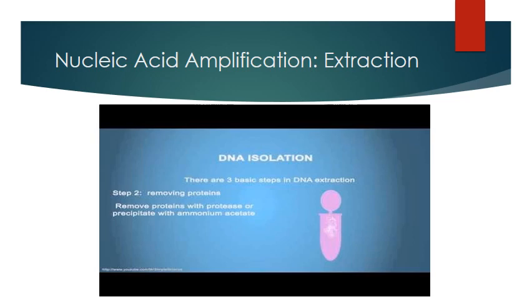So here is another video which you can watch at your leisure. This is a DNA isolation technique, which you can just look through as a tutorial. I'm not going to read it because it'll be read to you. And this is just for the extraction of nucleic acid. This is kind of just to go back and show you a cartoon of how it's done.